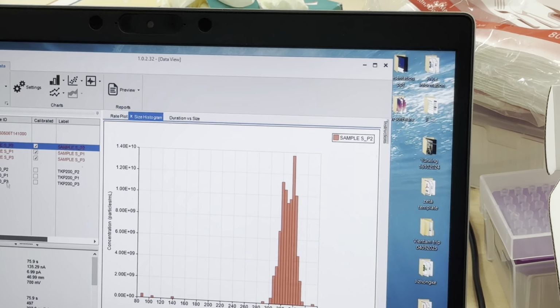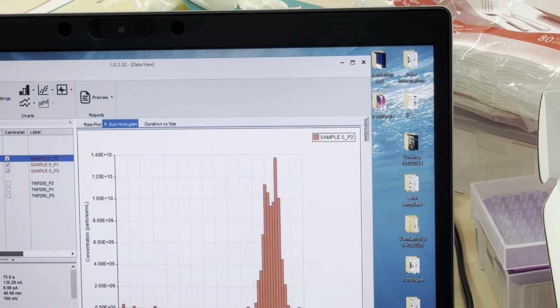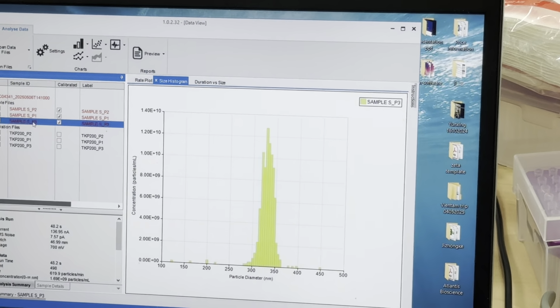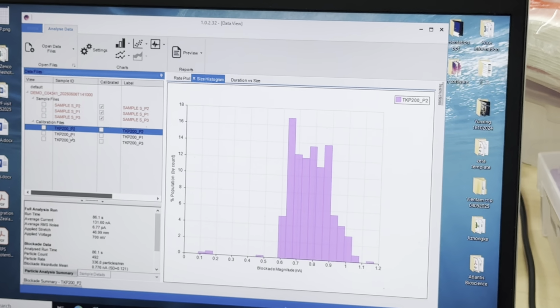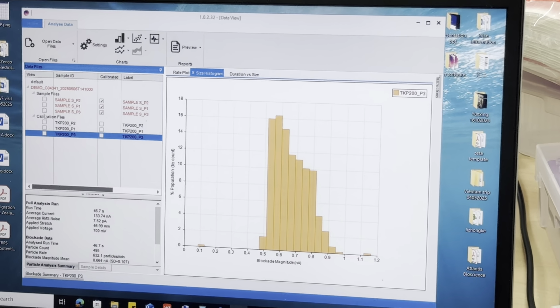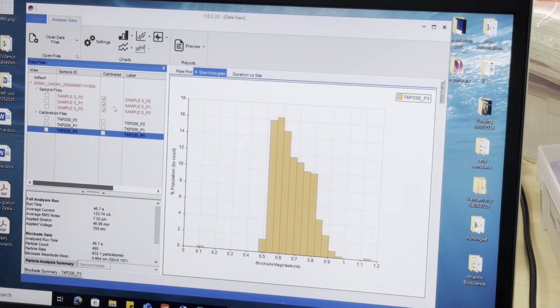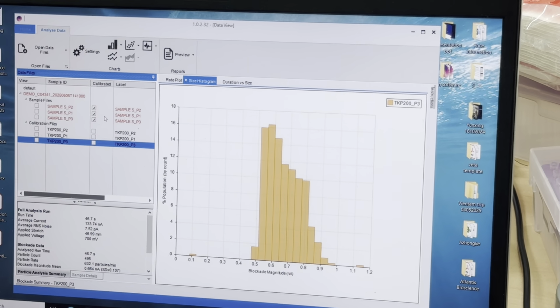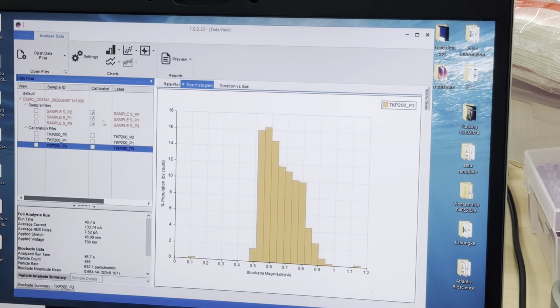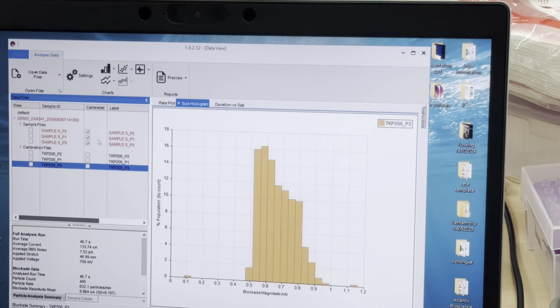You can see that it's not taking much time to measure. For one pressure, it takes around 1 minute, so it's like 3 minutes to do it. And for the calibrations, it's also around 1.5 minutes, so it's like 4 minutes. Add up to around 10 minutes, considering your pipetting time. So let's say within 20 minutes per sample for experienced users. So is there any of you who wants to practice?